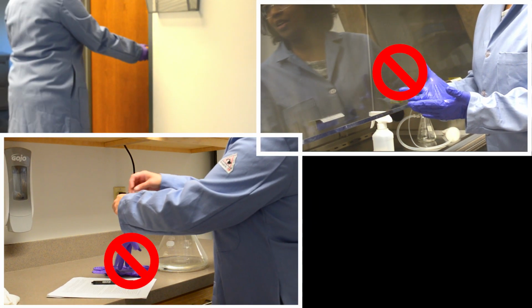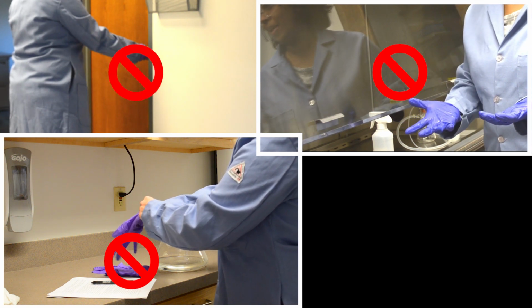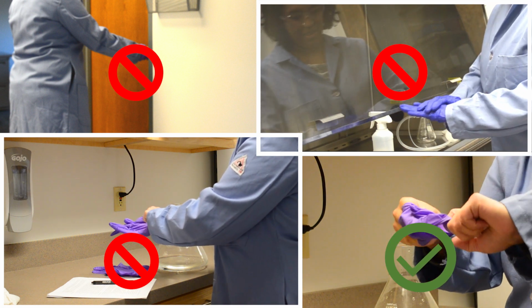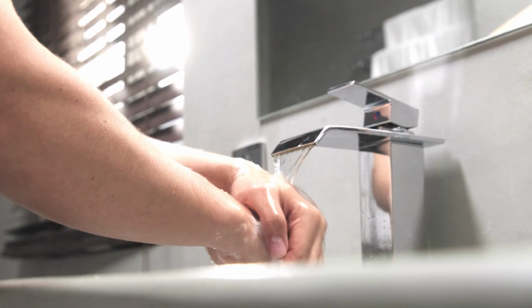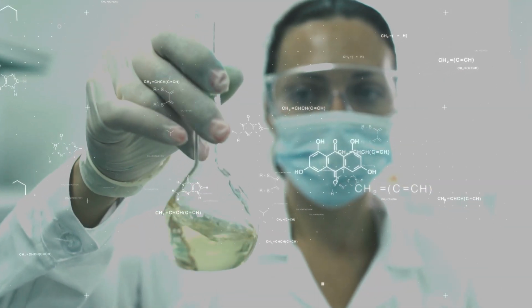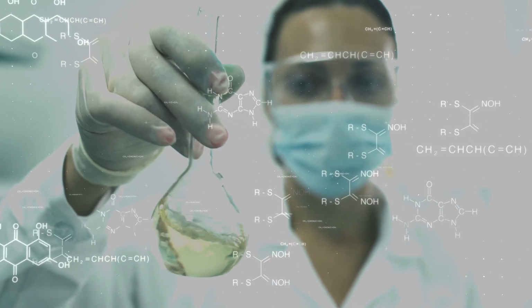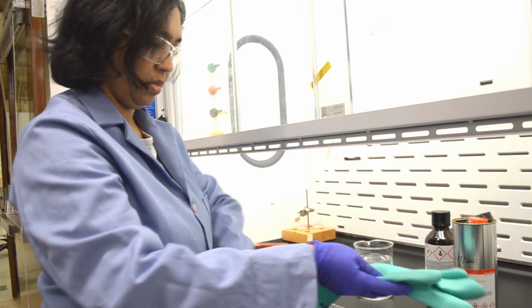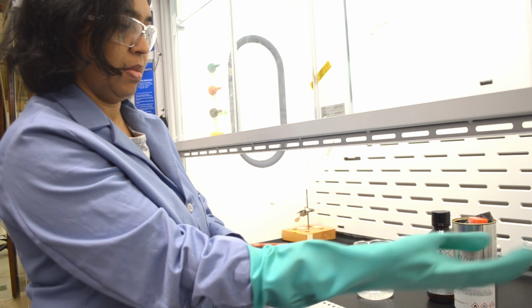Always remove gloves before touching common objects such as doorknobs, phones, or elevator buttons. Follow the correct technique for removing gloves and discard them properly. Wash your hands thoroughly after removing gloves. There are millions of known chemical substances and chemists are creating new ones every day. Always treat experimental and high-hazard chemicals with caution. When using especially dangerous chemicals, consider double gloving and changing gloves frequently.